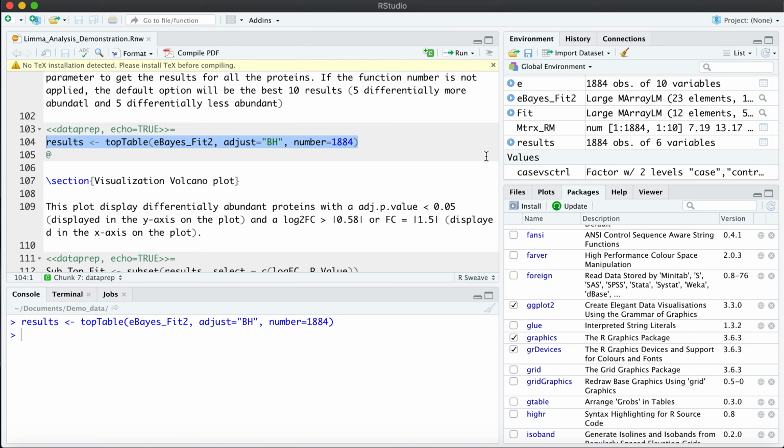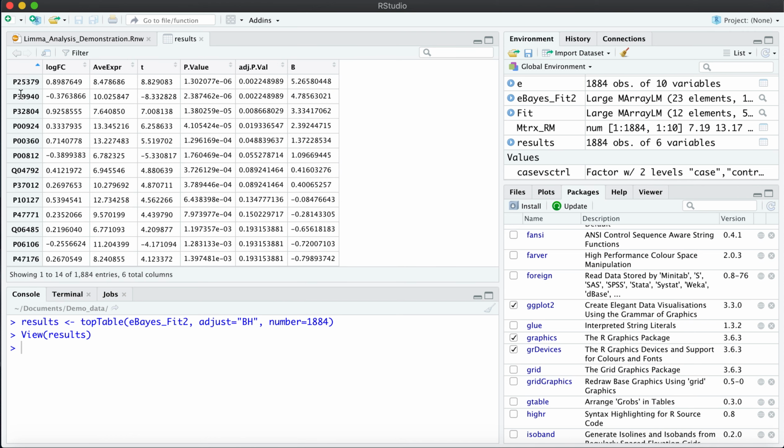and it will be a data frame, not a matrix in this case, and we can open these results. So in here, you see that in the whole pipeline that we have been running since the beginning, we still have the row names for each protein. Now we have the log fold change, the t-statistic results, the p-value, and the adjusted p-value with the correction, as well as the log odds of the analysis, which stands for the probability that this gene was actually differentially expressed, in logarithmic terms. But the most impactful and important columns of these results are log fold change, p-value, and adjusted p-value.